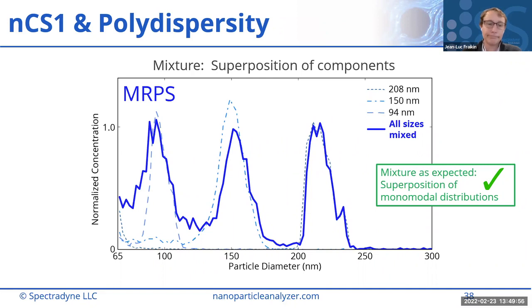So for many EVs, especially with the TEM studies, people report that there is a fraction starting at 50 nanometers. Do you think for EVs the optimal range will be something different than 400, maybe the cartridge before that range? Yeah, we offer a cartridge that goes from 50 to 300 nanometers. That's pretty optimal for EVs. I would say most of our customers don't care too much about the extra 15 nanometers that gets you.